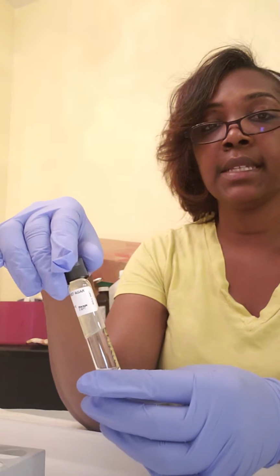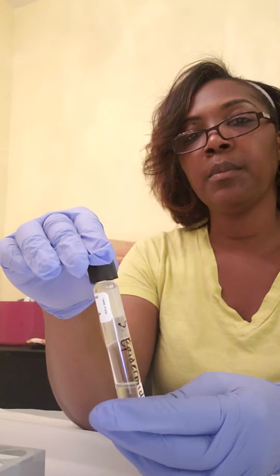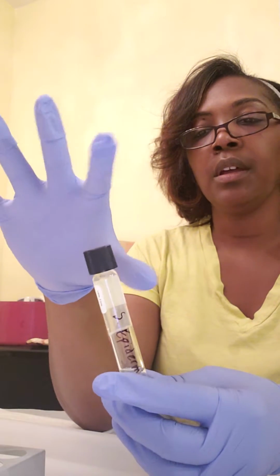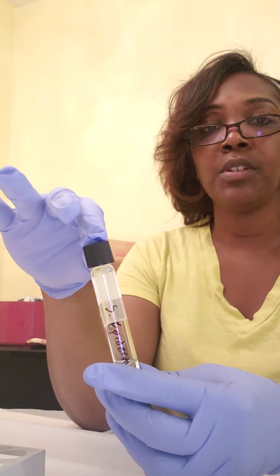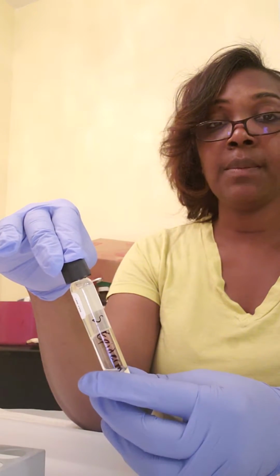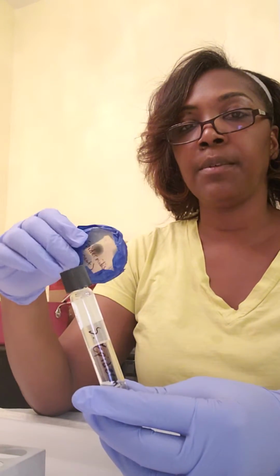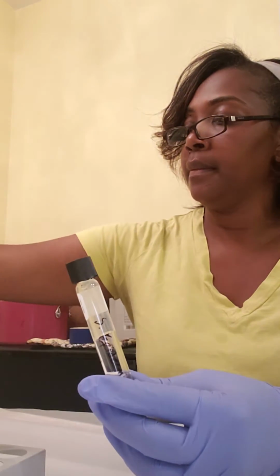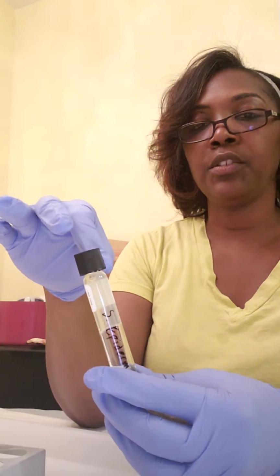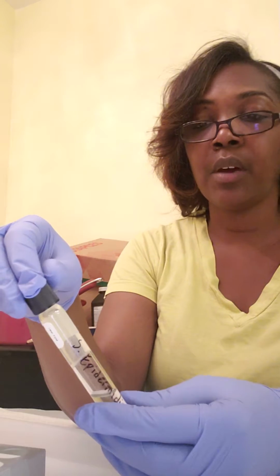Okay. The second is I went through the same process with the Staphylococcus epidermidis. Now this tube may be a little bit more difficult to see because the gel, I guess, coagulated at the top of the tube, maybe during the shipping process, but it did not shift down. So I did the same thing. I took a new paper clip into my Staphylococcus epidermidis, stabbed it into my tube, pulled it out, went through the sterilization, incubated for 72 hours.